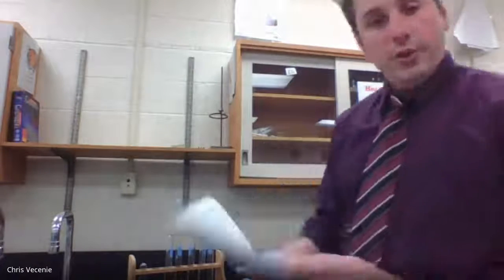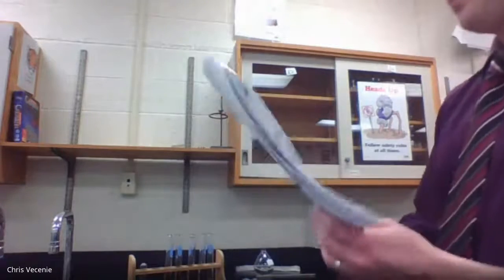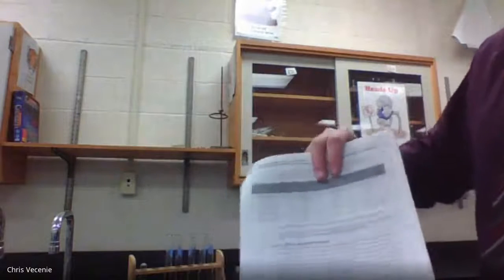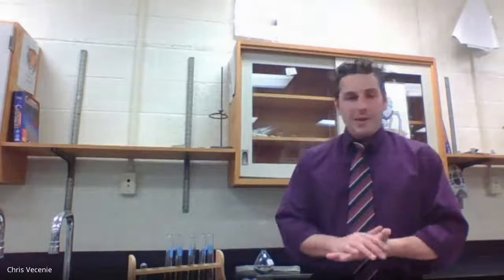So what you would do in the next part of the experiment is you go to your test solution tables. And if we do that, a couple differences. This time, we're using a different molarity of the FeNO3. We're using a different molarity of the KSCN. So the idea there is I have created different concentrations, and we want to see, are we going to get the same equilibrium constant? Because I'm claiming that when these guys reach equilibrium, no matter where I start them at with molarities, if I do products over reactants, raised to the power of the coefficients, and do that division, they should always yield me the same number.